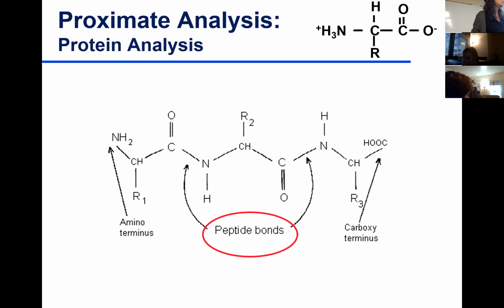But if you have a mixture of intact protein and digested protein, with small fragments in there, not every fragment potentially has an aromatic amino acid. You break down the protein and you get different fragments, and not every fragment has an aromatic amino acid. So then you would have to measure at 220 if you're doing a UV absorption measurement.